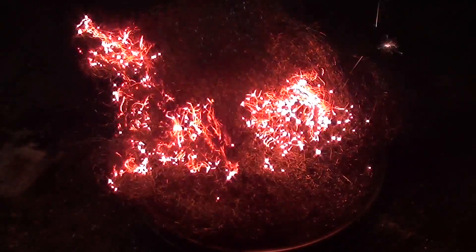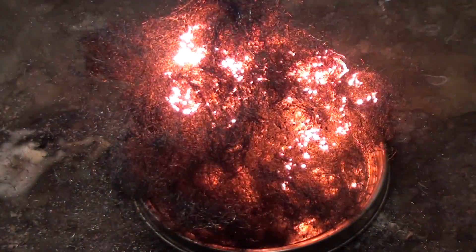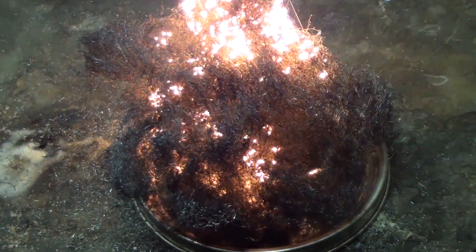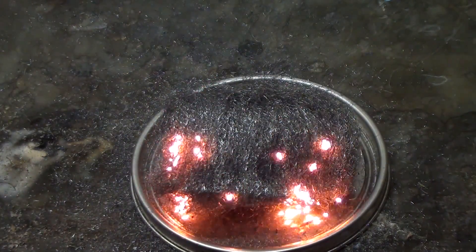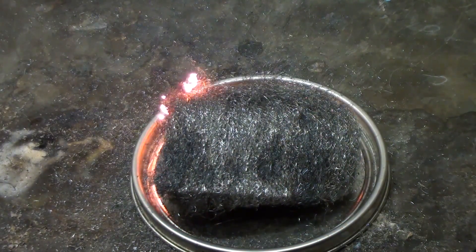Let's try that again. Be careful when doing this as the wool will throw off sparks that might set nearby things on fire. You have to fluff it up a bit, because if you use compacted steel wool the air can't get in and oxidize the iron.